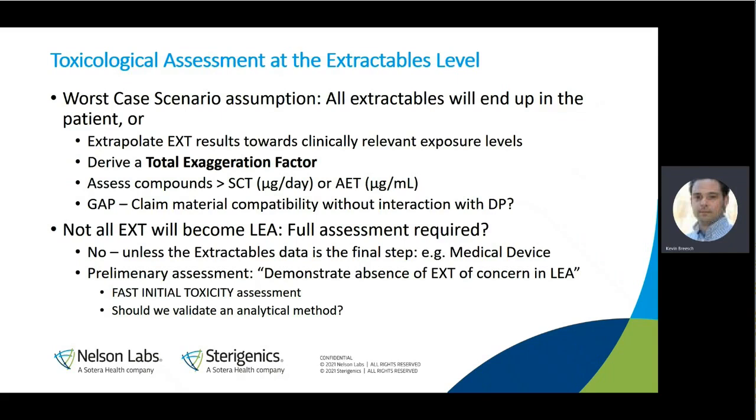We do that by using the ISO standard total exaggeration factor. So we try to quantitate how many times the extraction conditions were exaggerated compared to the clinical use. And we need to assess all the compounds above the safety concern threshold. This is a nominal value, how many micrograms a day a person can get, and how to convert it to an analytical evaluation threshold, a concentration in the extract or in the drug product itself, being called the analytical evaluation threshold.